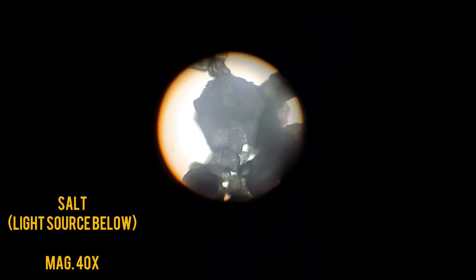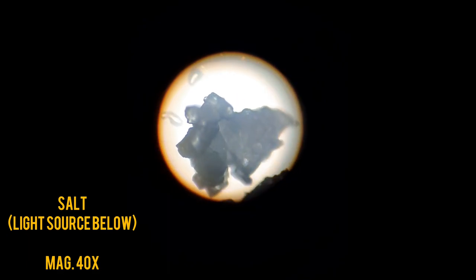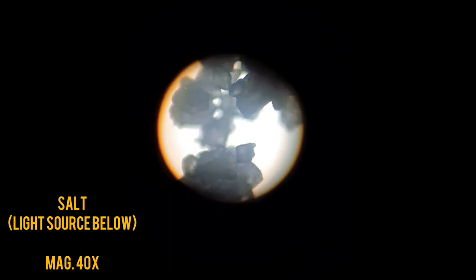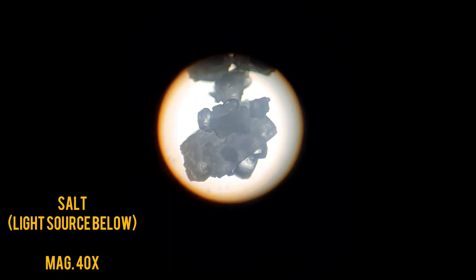Oh, we'd not like this. Nobody wants to be salty. Yes, yes, this is what salt grains look like under a microscope.